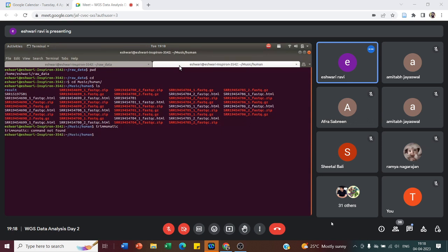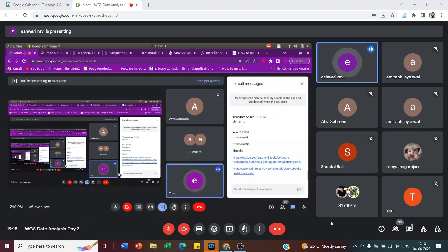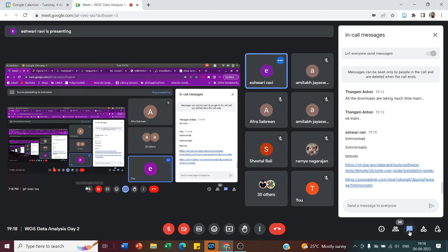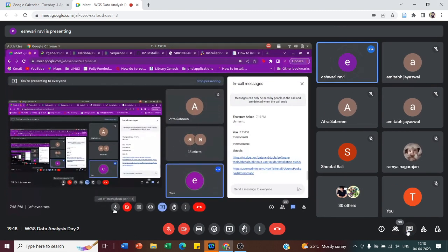Is everyone online? I can give you 5 minutes, when you're set up, so that I can show you the Trimmomatic command as well. I can wait for 5 minutes to proceed. Just want everyone to be on the same page.